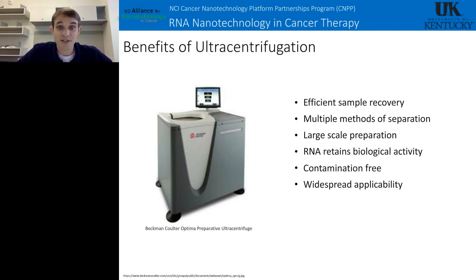It's contamination-free as long as you work to prevent any degradation of your natural RNA. Then it's relatively easy to keep contamination-free, and your RNA will also retain its biological activity because most of this is just carried out in different salt solutions, and RNA is very stable in most salts.